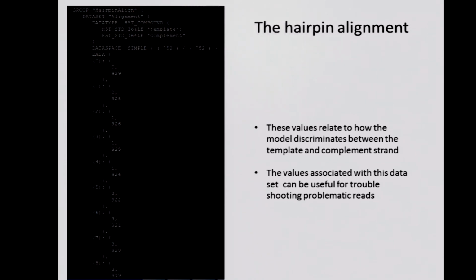I have seen instances, however, where the model messes up, and if you go to the event space for a really long 1D read, you'll find characteristic patterns that you can manually say, that must have been the hairpin, because it's not always perfect. But these characteristic voltages, these positions, these alignments, tell the system where you are in the sequence so you can predict which model to use for calling which 5-mer or 6-mer base sequence.